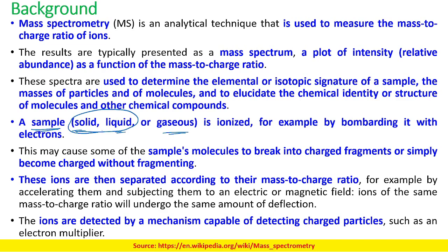If it is a liquid sample, suppose you have a DNA sample. The DNA sample is usually present in an aqueous medium. Suppose we have a DNA sample dissolved in water. So initially we have to evaporate the water, so vaporize the water. After it is vaporized, at the same time we have to make sure that the DNA samples get entry into the ionization system in very tiny parts.